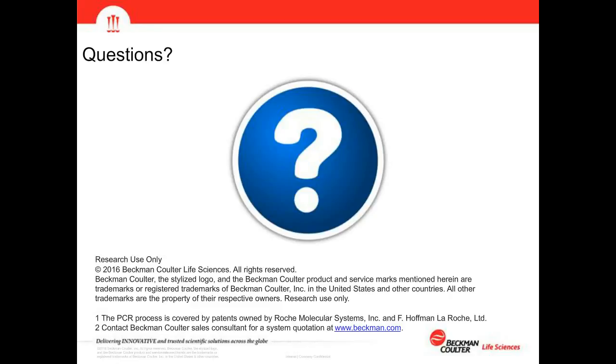Then we typically need about a day to come into the lab and get the hardware configured, make sure all the checks and balances are taken care of, and then approximately the time of the manual prep to go through the protocol and the automation with water testing, and then potentially some portion of a live run to ensure that everything is working, maybe generate some data with the customer prior to the application scientist leaving.